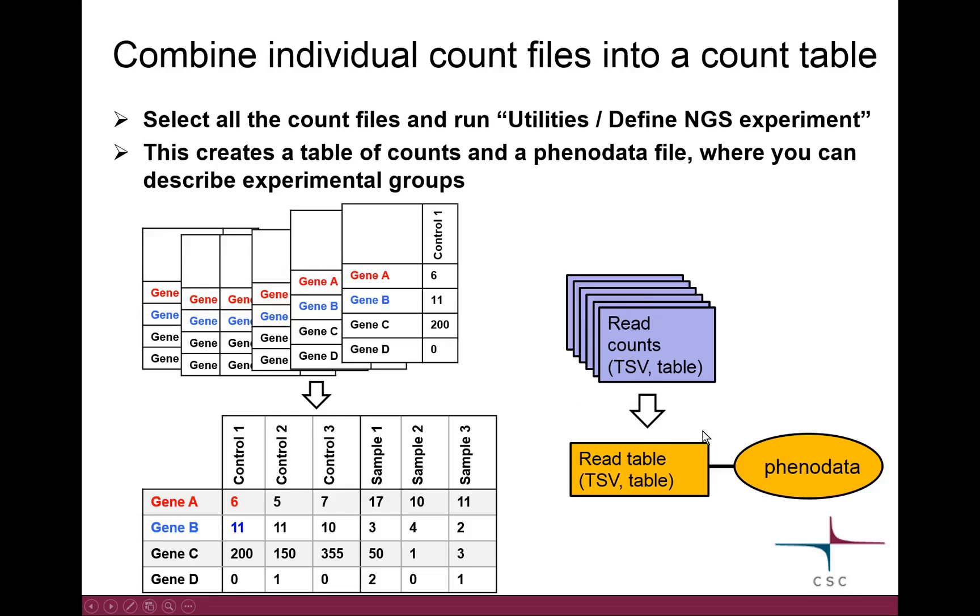Now what we are going to do in the next step is we select all these files. In Chipster you can do it so that you keep the control key down to select several files. And then we run a tool called, it's in the utilities category, it's called Define NGS Experiment. That will then combine all your count files into just one big table.